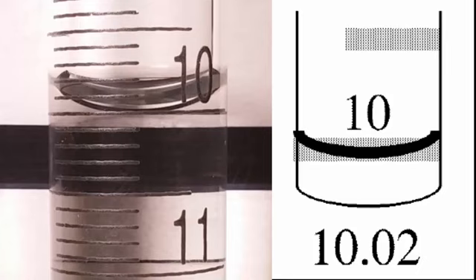For instance, in this example, the line that circles the burette is the 10.00 marking, which means that the top of the line is 10.00 and the bottom of the line is 10.02. Knowing this, we would read this burette at 10.02 because the meniscus is well below the top of the line but still not visible below the line.